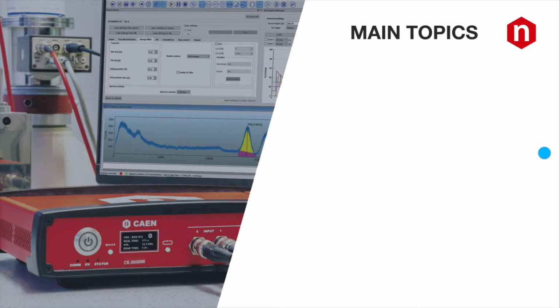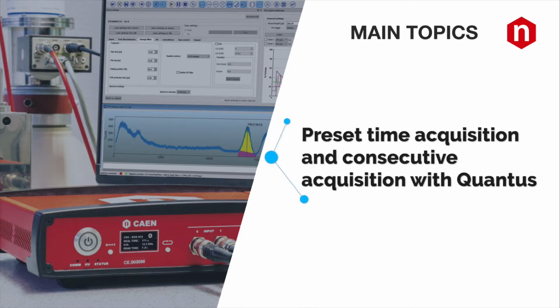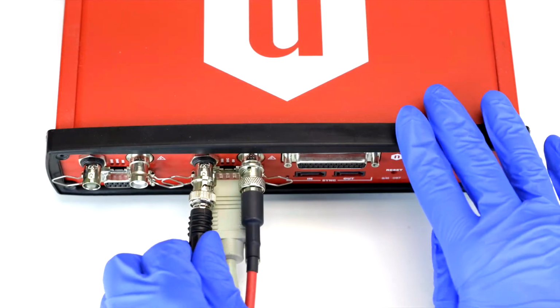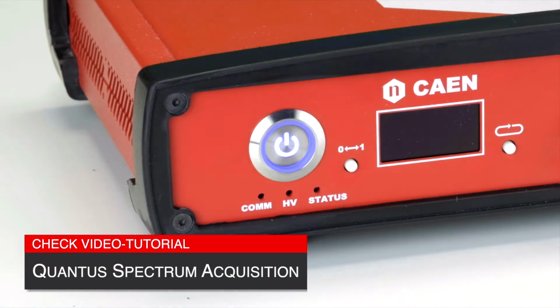In this video, we will learn to use the Quantus run control tab to perform preset time acquisition and consecutive acquisition. First step, connect hexagon to the detector and the Quantus software to the board as explained in the video tutorial Quantus Spectrum Acquisition.